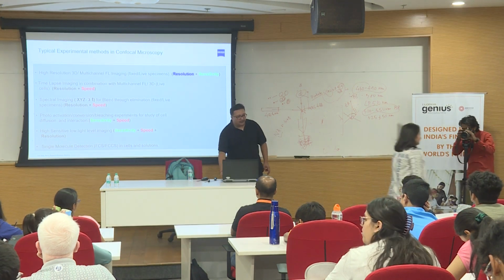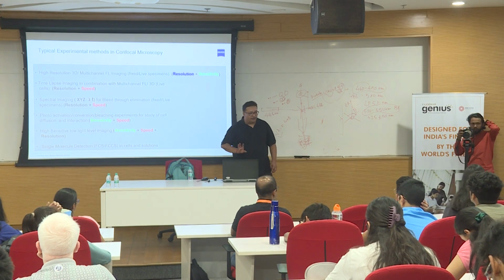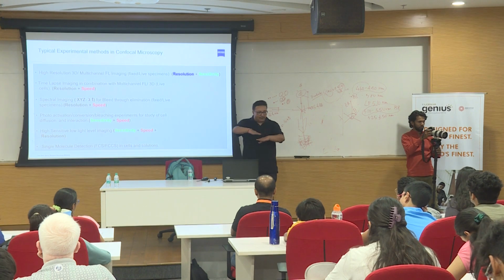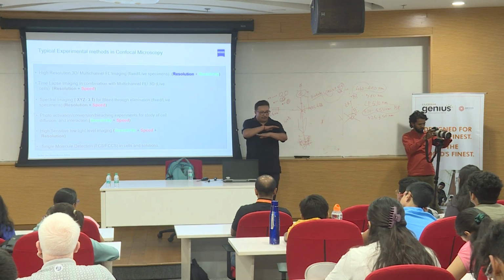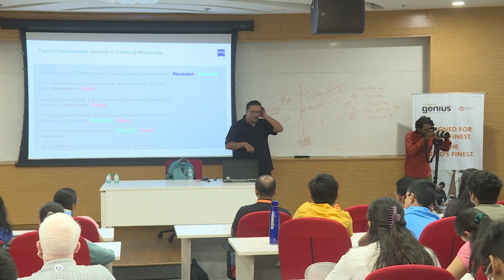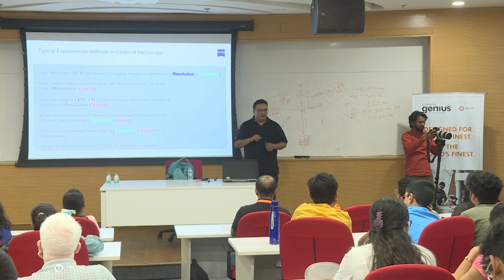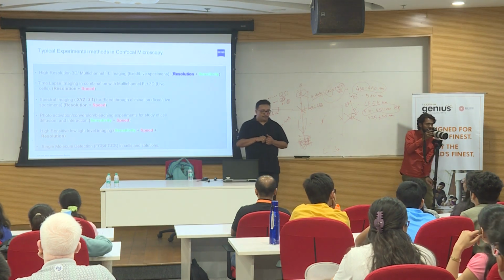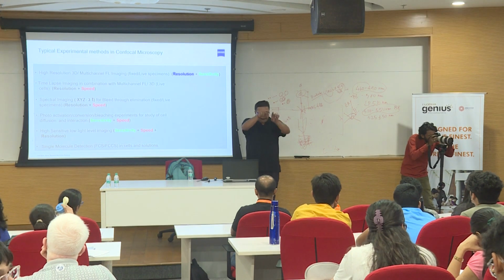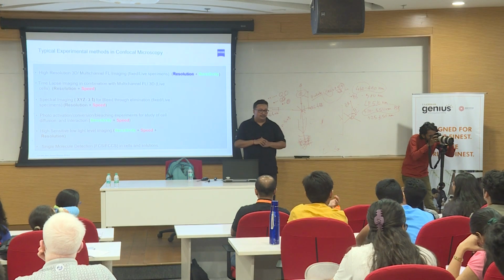And these detectors are available in a confocal, because when we talk about a confocal, we don't talk about imaging a single plane in parallel, meaning excitation falling on a single plane and emission collected in parallel out of that single plane. Confocal is called a laser scanning microscope. So what do you mean by laser scanning microscope? It means it is illuminating point by point to create an image.